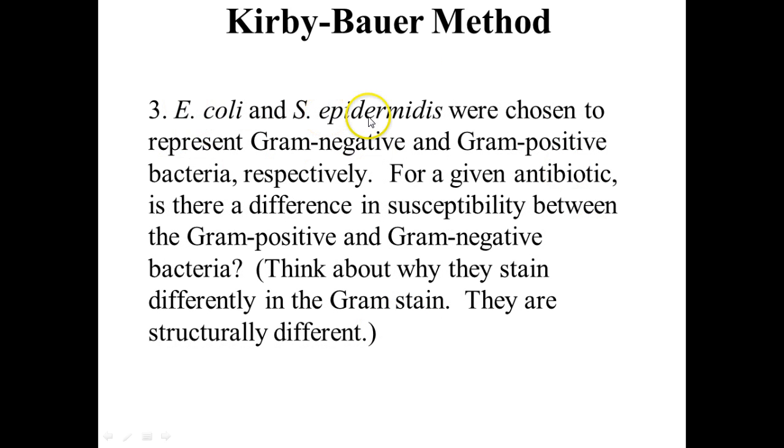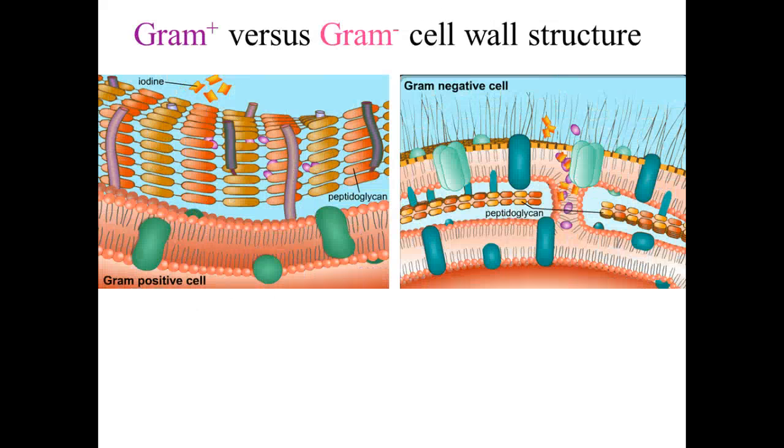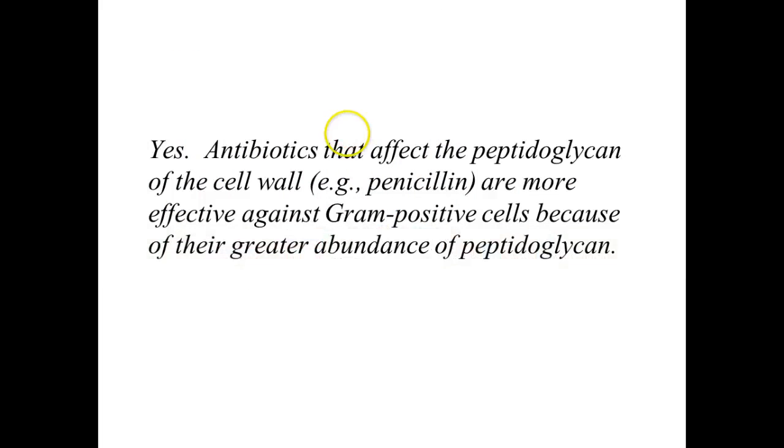As I said, we're using 2 representative organisms so you can compare the difference between gram-negative and gram-positive. So remember, what's the difference here? It's the same difference that's why they stain differently. It's the difference in the cell wall structure, right? That peptidoglycan. Gram-positives, the staph, have a really thick layer. Gram-negatives have that thin layer, and they have that outer membrane. And that really plays a key role when we talk about antibiotic susceptibility here, or sensitivity. I stumble on susceptibility. I can't say that word. So there are our differences.